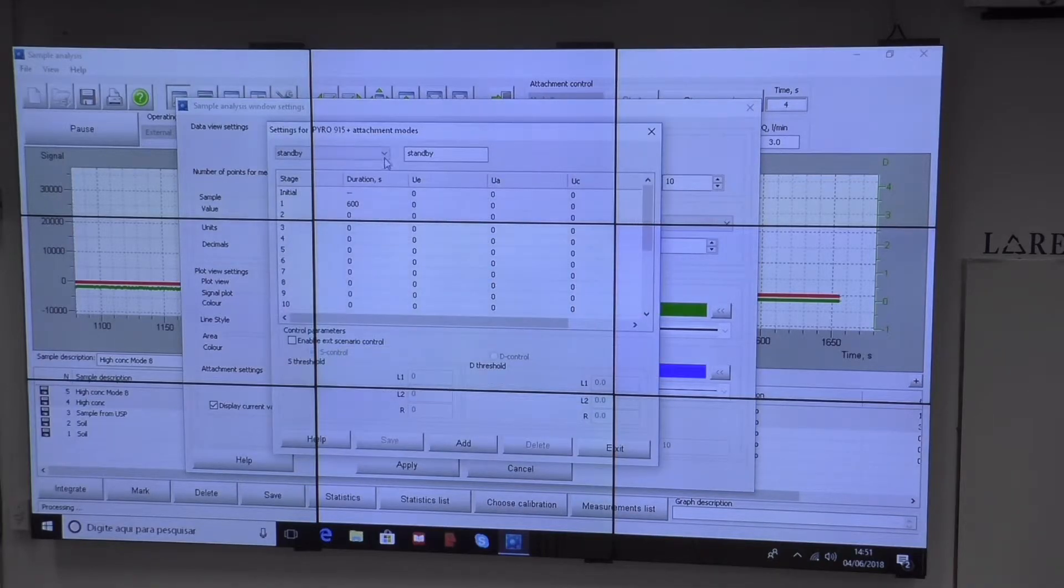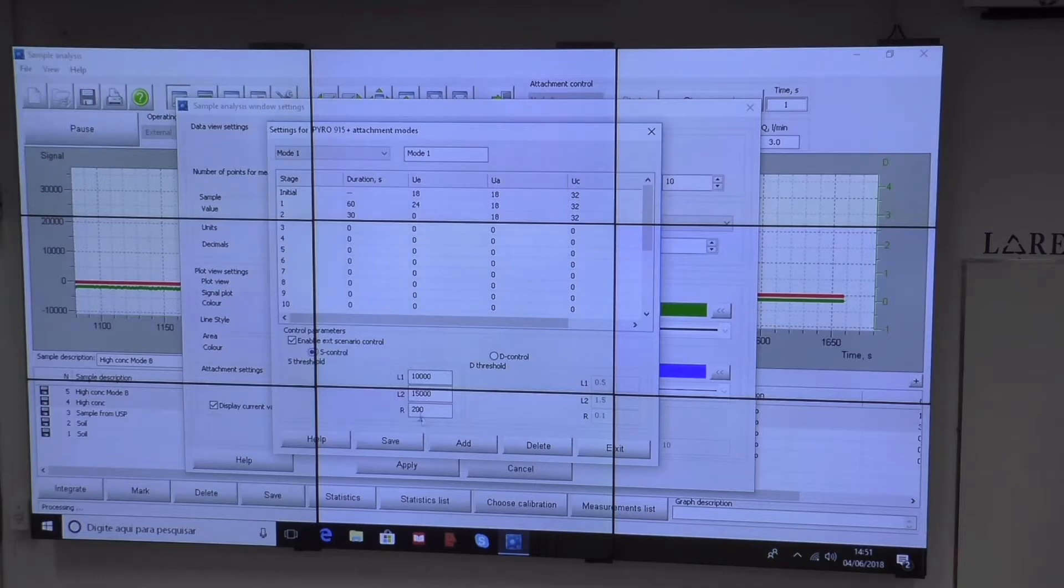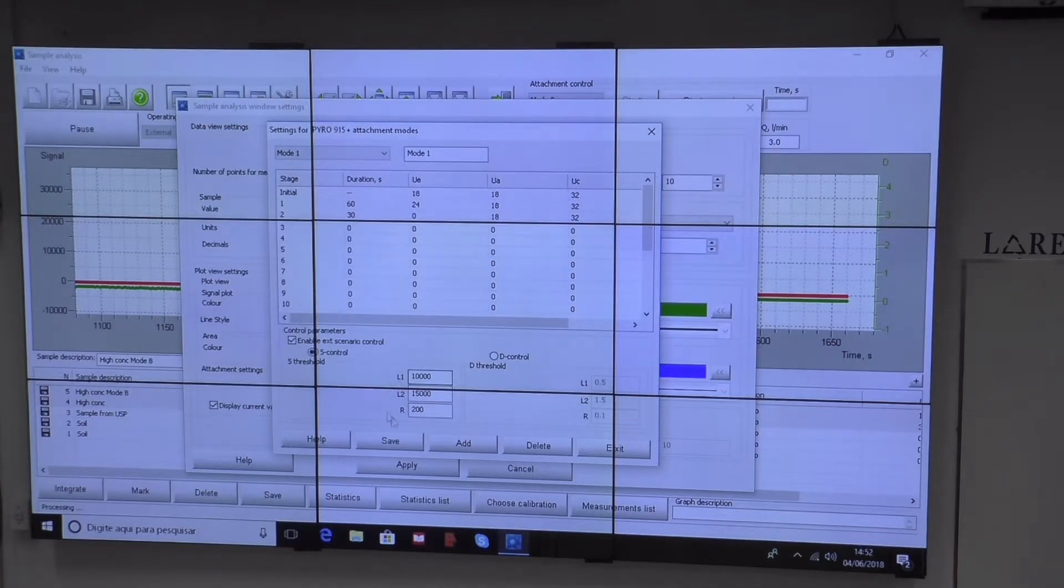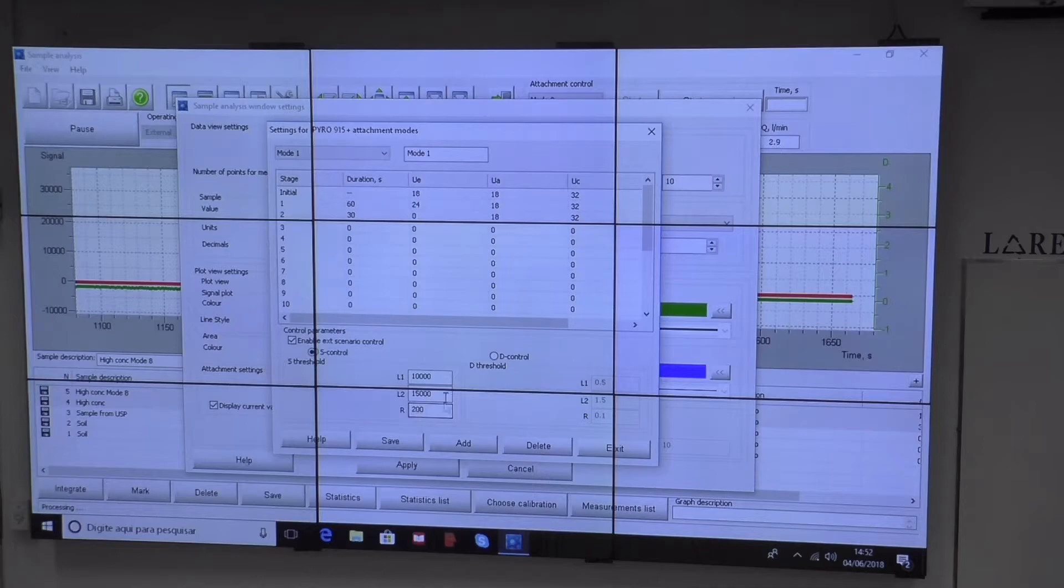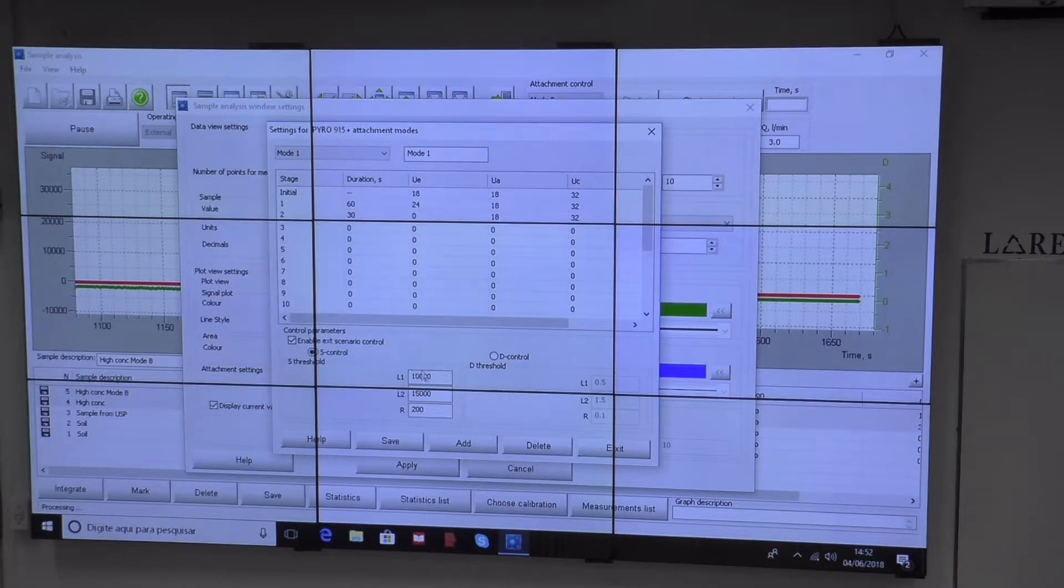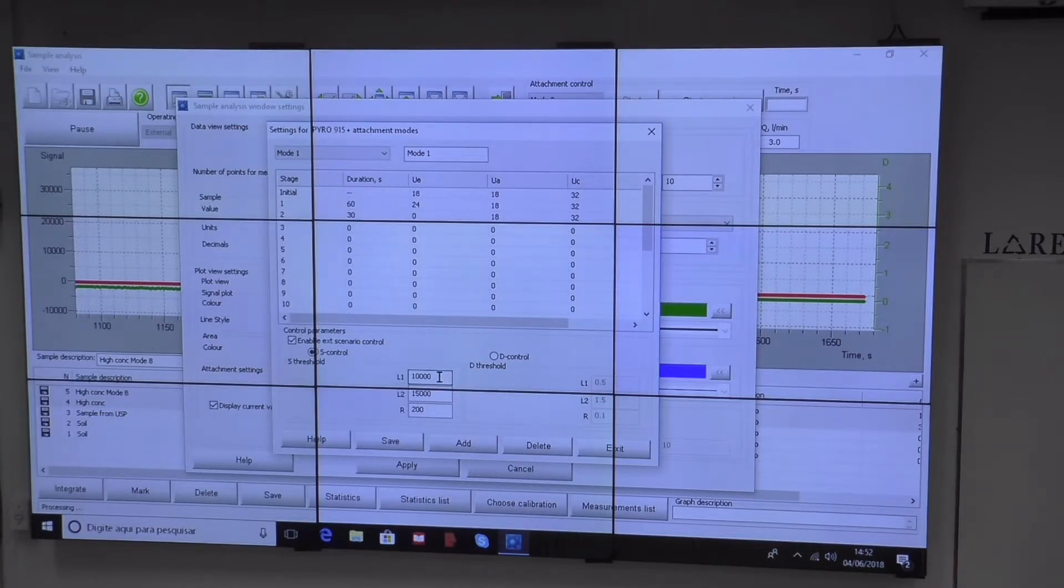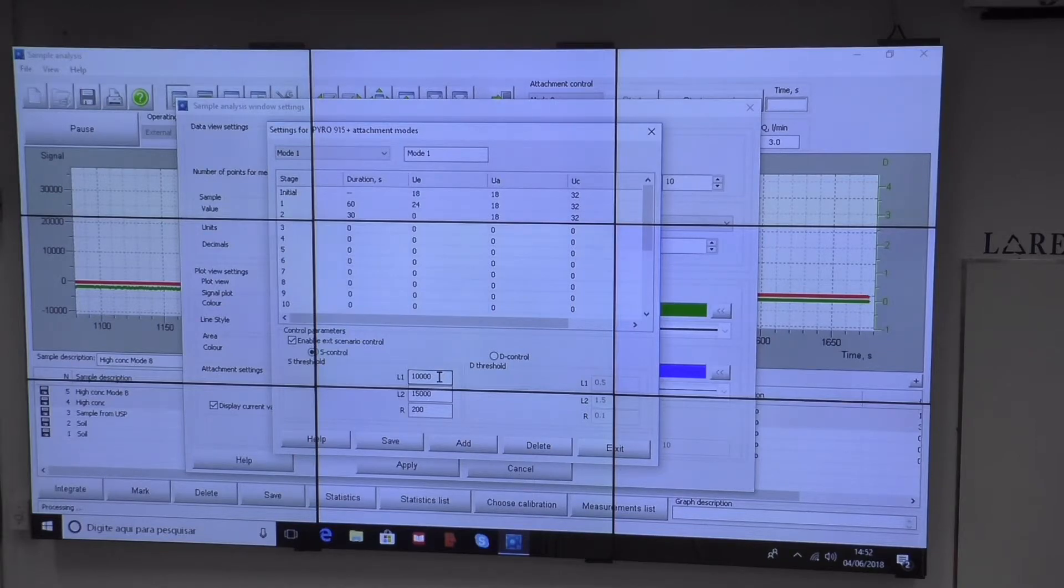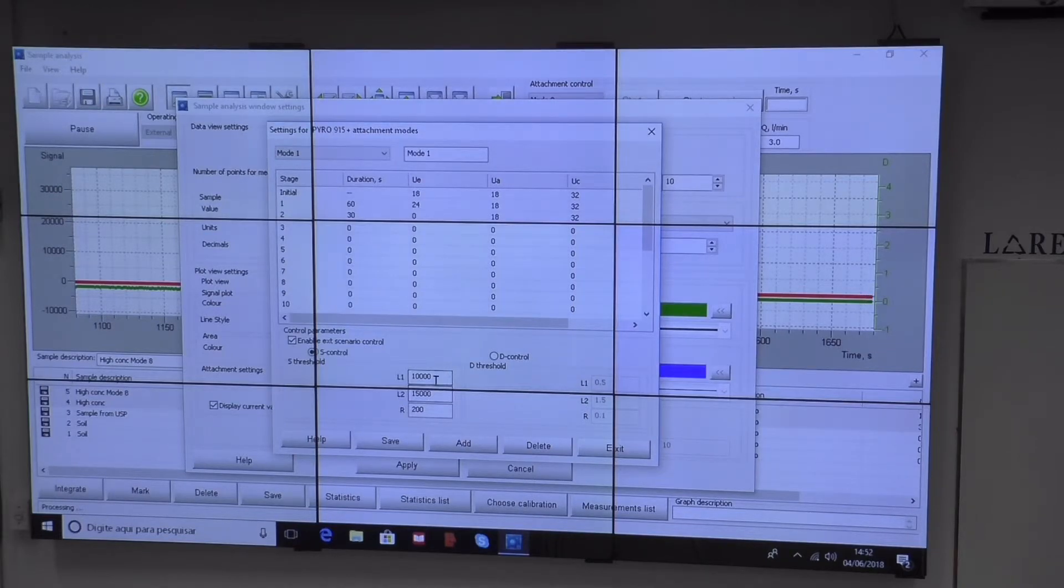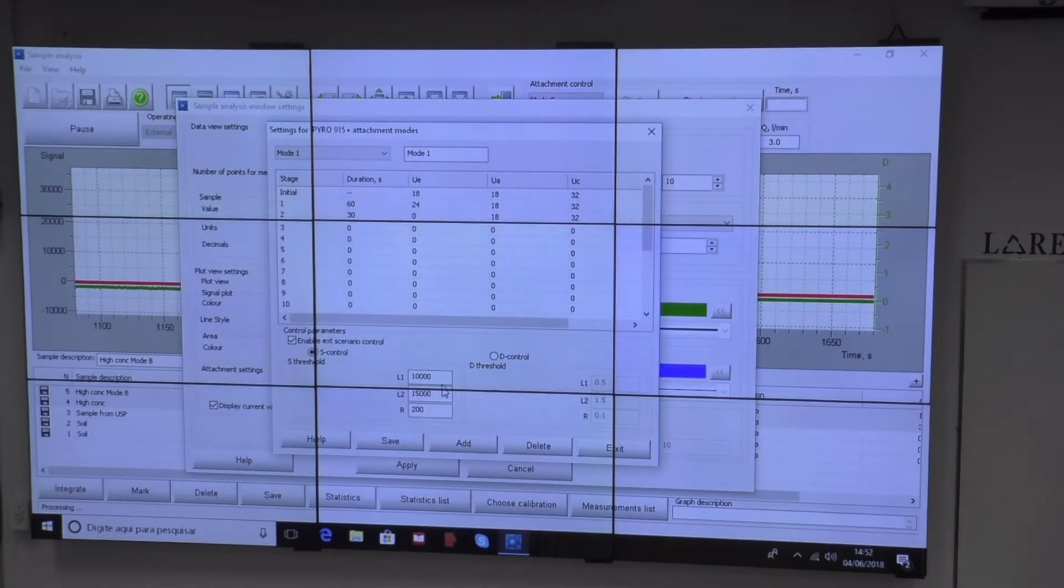Here in modes, for example mode 1, I've established these parameters for the closed loop system. Now it's controlling what's going on. If the signal goes to values higher than L1, the software takes control of the temperature profile and tries to keep it between L1 and L2.